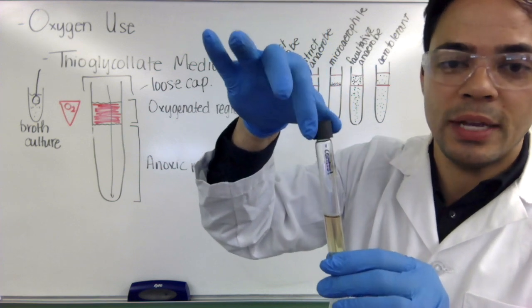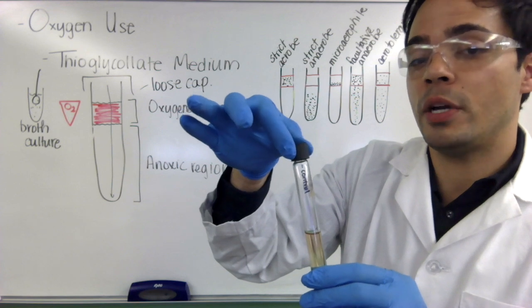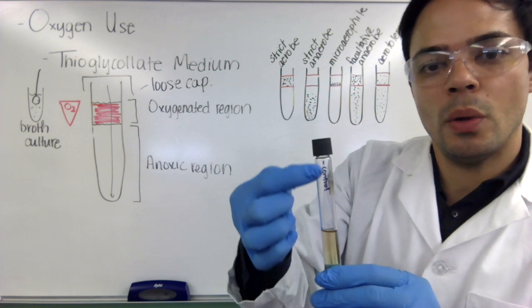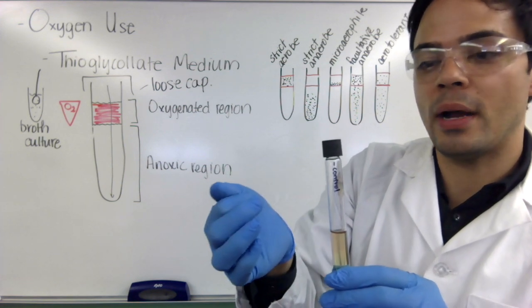Do not label the caps because I will tell you if you try to put tape on the caps and you try to get that off, it'll be very, very difficult to remove. If you write on here with a Sharpie, you can always remove Sharpie from glass tubes with a little bit of alcohol and it'll come right off.